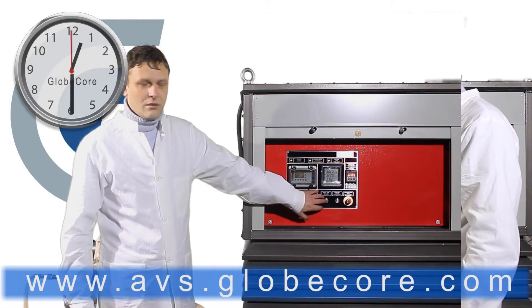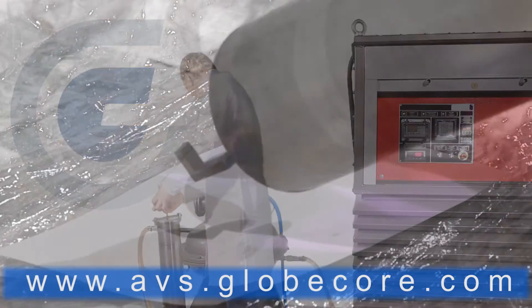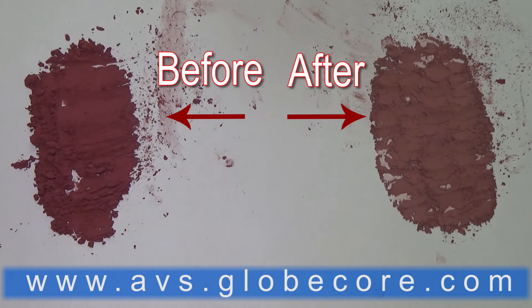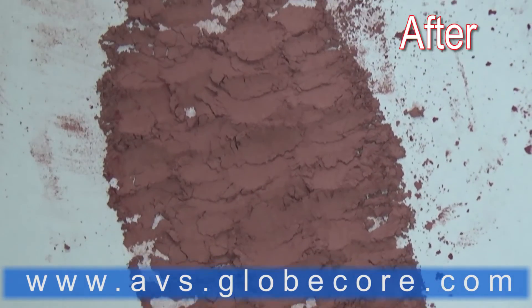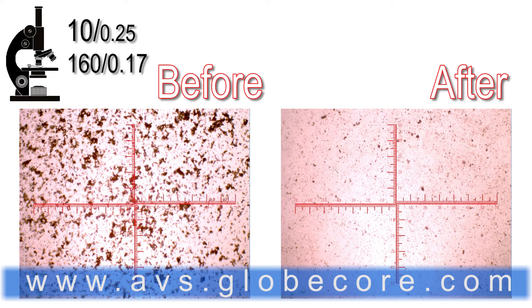In the pulverization process, we used 400 grams of dipole ferromagnetic elements made of SH-15 steel. The process took 30 minutes at a temperature of 90 to 100 degrees centigrade. The color of the mix changed due to particle pulverization from bright red to pale pink. You can see the results of the process in the photographs taken through an optical microscope.